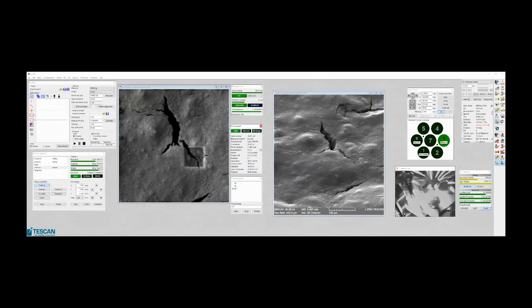So for this, I have here this draw beam. You can draw whatever you want, like a line. You have different information here, like where to put the line, the size, it will be 0 and let's say 20.